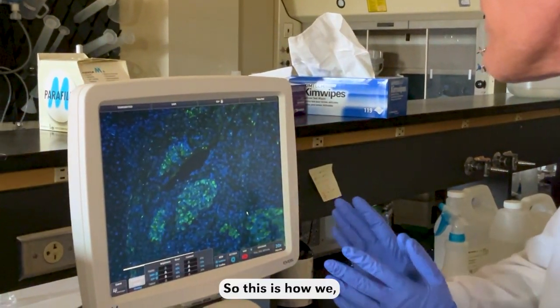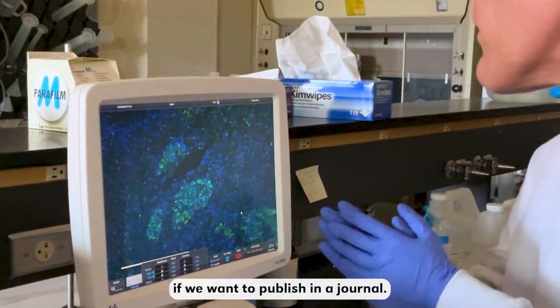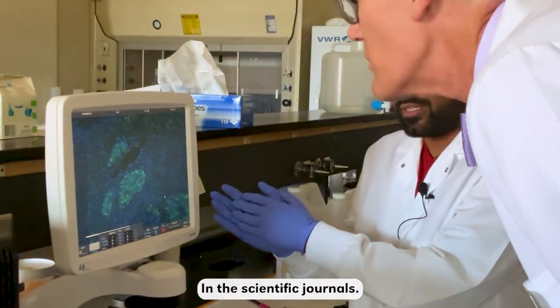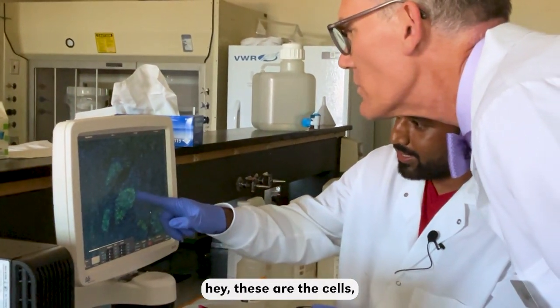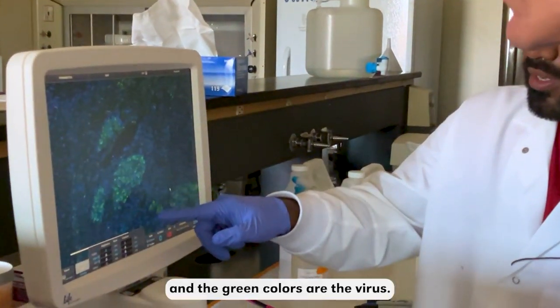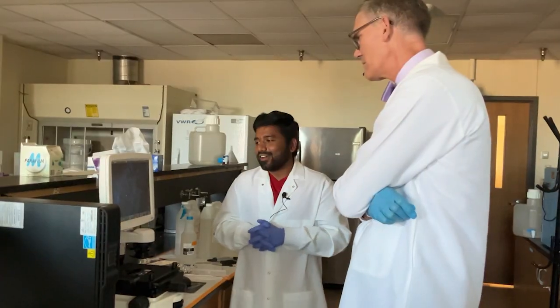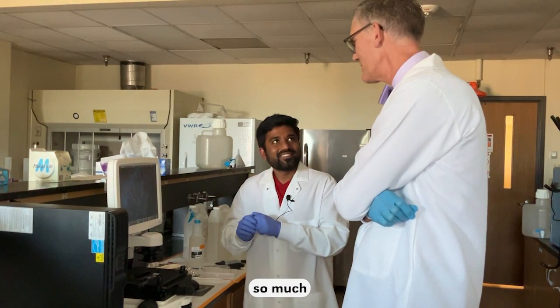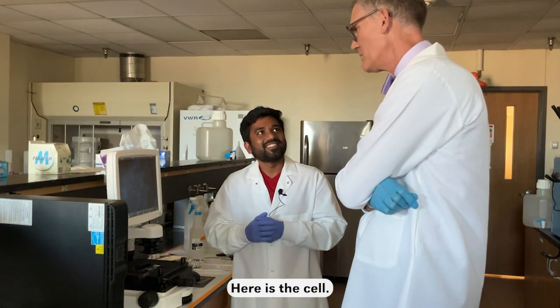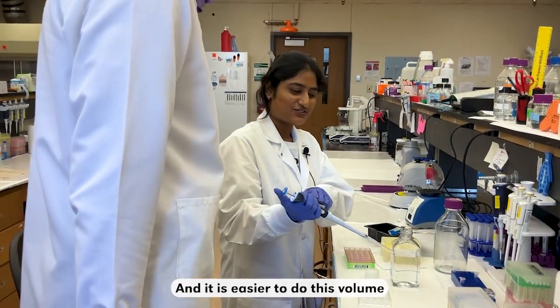This is how we represent the image if we want to publish in scientific journals, because we say the blue colors are the cells, and the green colors are the virus. So the cells are infected with the virus. I like this so much because we can see here is the virus, here is the cell. I like this technique so much. And it is easier to do this volume.